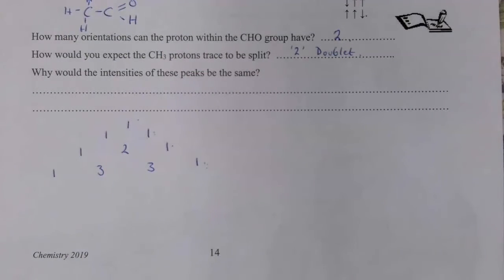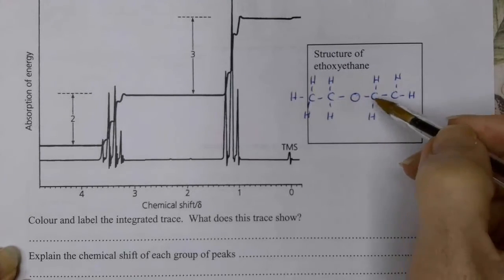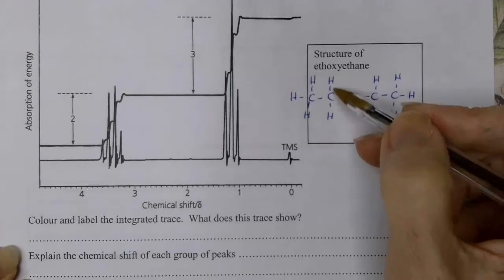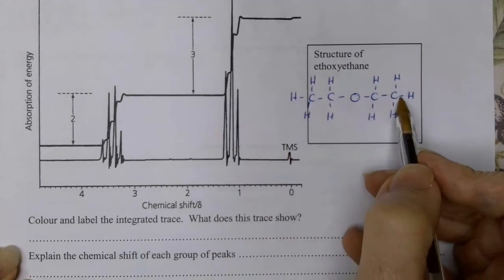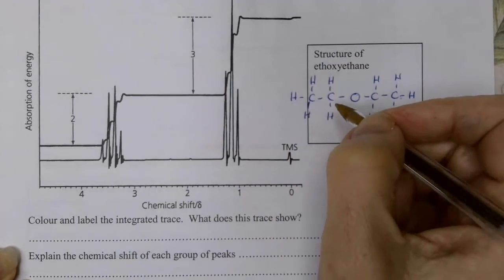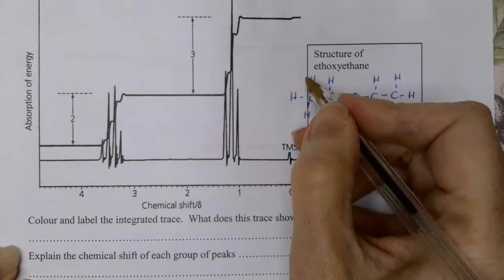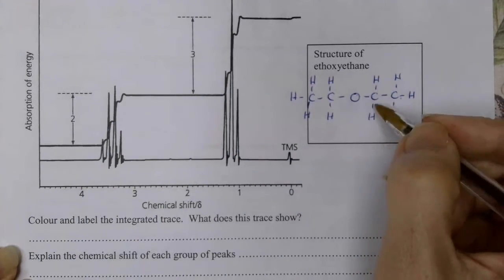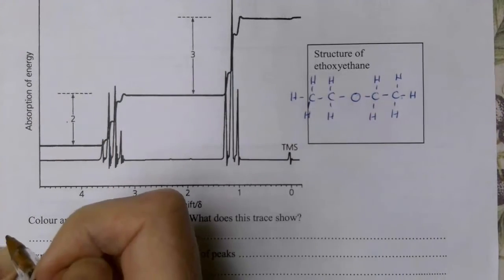So here's a molecule you've not come across before, ethoxyethane. It's what we call an ether. But hopefully now you should be able to work out that it's got 2 hydrogen environments, because this hydrogen environment and this hydrogen environment are identical, as are this one and this one. So again, when we split them, we should get the ratio of the lines. I've got 3 hydrogens here, 3 hydrogens here, so I've got 6 hydrogens in this environment and 4 hydrogens in this environment. So that gives a 2 to 3 ratio.